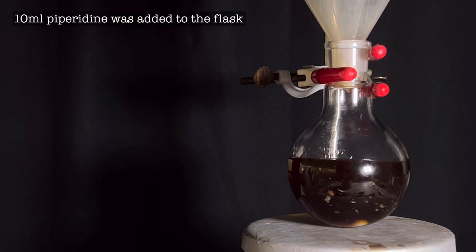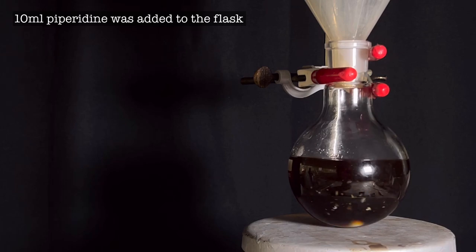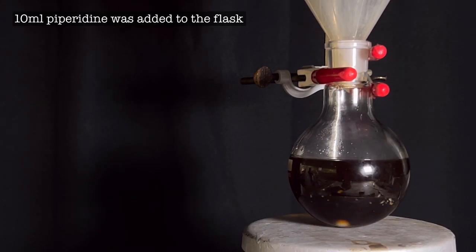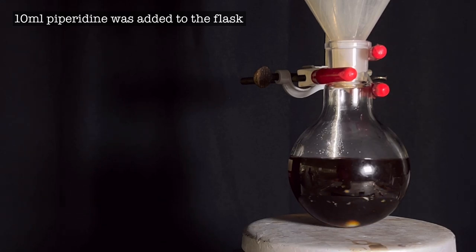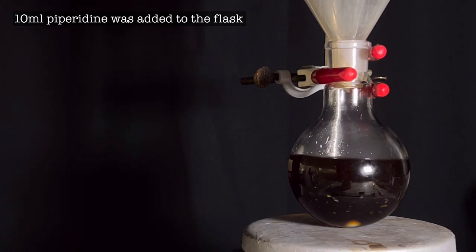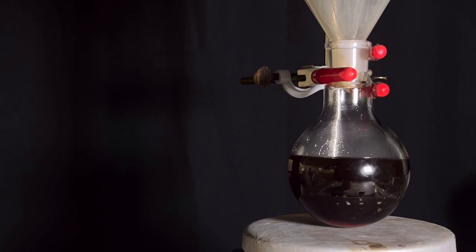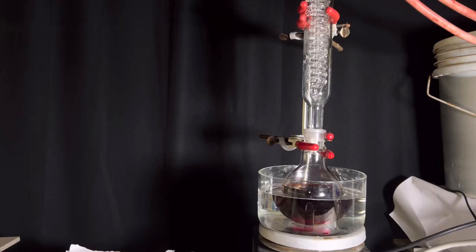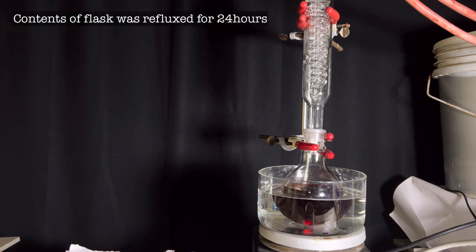Piperidine is a heterocyclic amine which is a controlled substance in many western countries. Piperidine is toxic and causes severe skin burns and eye damage. Piperidine was added in small portions at a time. Then the flask was placed in a water bath and a dimroth condenser was attached on top. The contents of the round bottom flask was then refluxed for 24 hours.